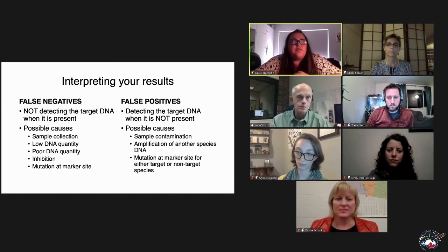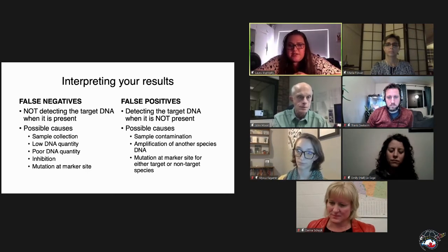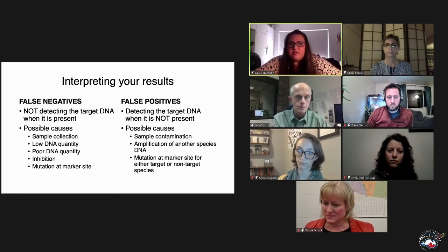So for the study that I presented, I didn't get any false positives in the data that was used in the paper, but I was encountering false positives before I changed my contamination protocol. So as we talked about, you need a clean room to do the extraction. You've got to make sure that you're bleaching everything all the time.